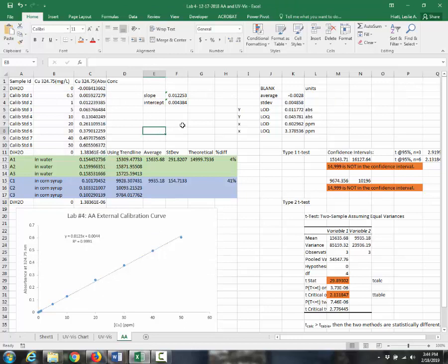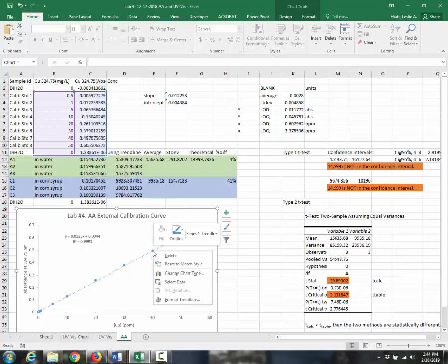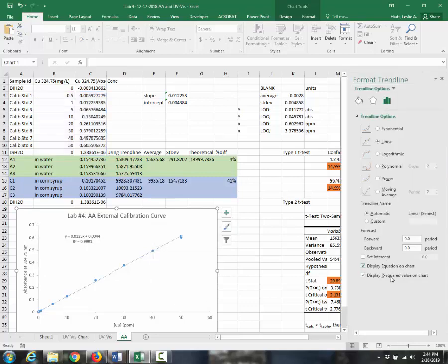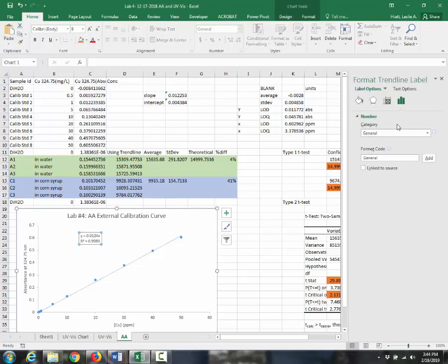Okay? So now, how did I use that? I was given the concentrations and the absorbances. Also, the AA automatically gave me some concentrations, but the AA forces the intercept to be 0. Now you can do that if you wanted to compare them and see how they do. And how you would do that: I would right click, format trend line, and then I would set my intercept at 0. And why that's interesting is I could see how that compares.